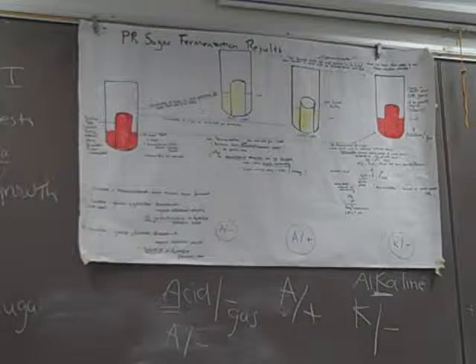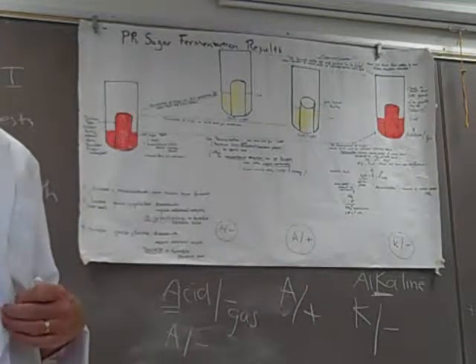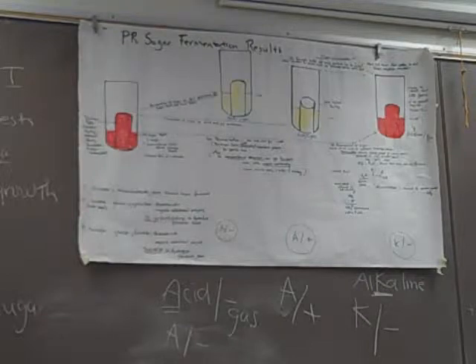Now, is today Thursday? Today is Thursday, right? So if we put your tubes in there today, Thursday, Friday, Saturday, Sunday, Monday, Tuesday, 5 days, that's way too long to incubate these. So that's why it's so important that we put all of our Tuesday, Thursday tubes in that middle 37-degree incubator, because that incubator will be turned off Saturday. We do want to give them 48 hours. This incubator over there, that's the Monday, Wednesday incubator, so that incubator will be turned off tomorrow. So it is kind of important that you put your tubes in the right incubator. We'll turn the incubators off Saturday so they don't over-incubate.